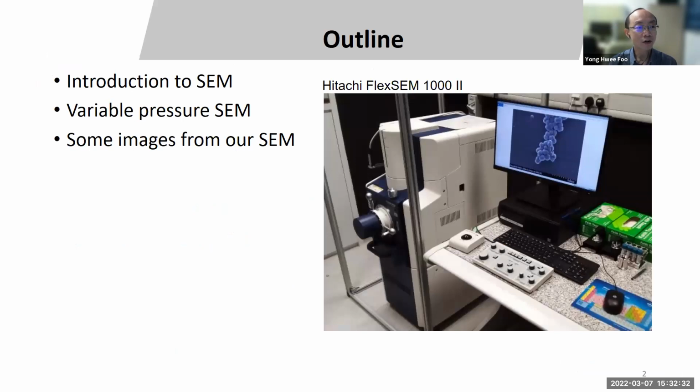The outline of the talk is, first I will introduce the SEM, followed by the variable pressure SEM. I will then conclude the talk by showing some of the images that we have taken from our very compact Hitachi SEM in our facility.